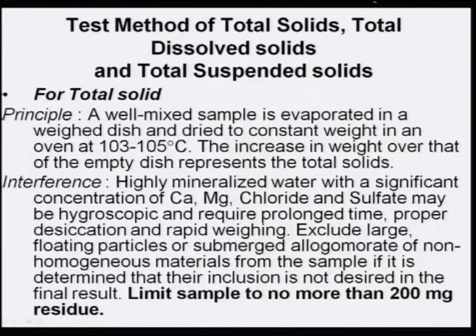Today's lecture is based on chemical analysis. It is a very important area where the aspect of and importance of chemical analysis have been highlighted. Test methods that are used to find out total solids, total dissolved solids and total suspended solids.